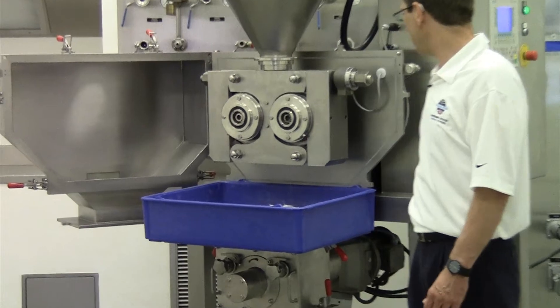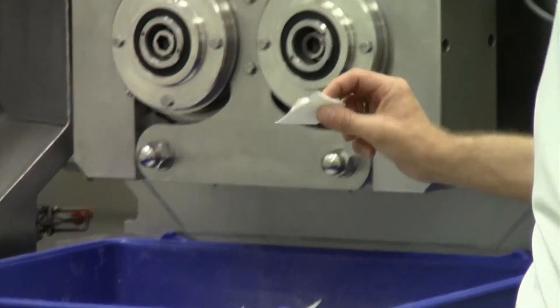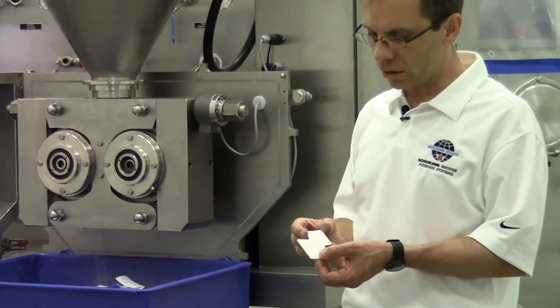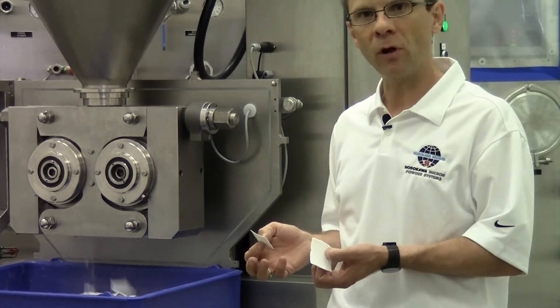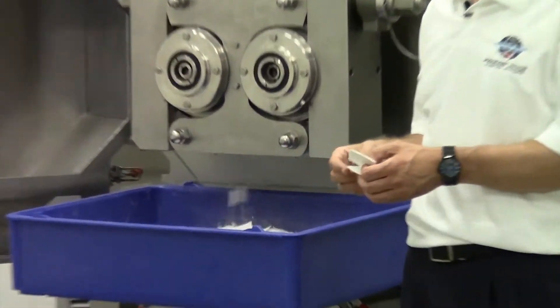What we are producing now are flakes. We separate the total machine from the flake crusher for demonstration — it's easier to get out the flakes. What you see here is compressed lactose. The lactose comes out of the machine and will be crushed in the flake crusher.